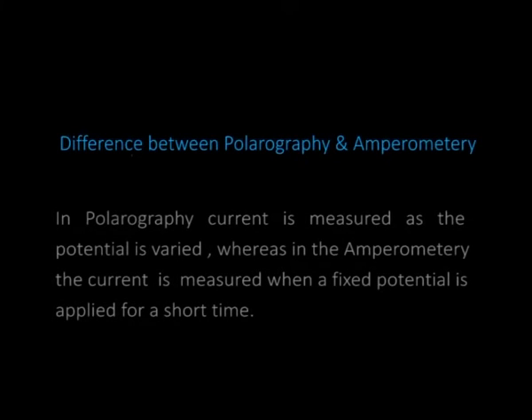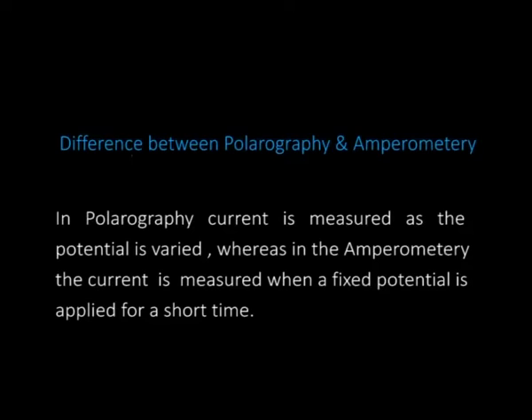Difference between polarography and amperometry. In polarography, current is measured as the potential is varied, whereas in amperometry, the current is measured when a fixed potential is applied for a short time.